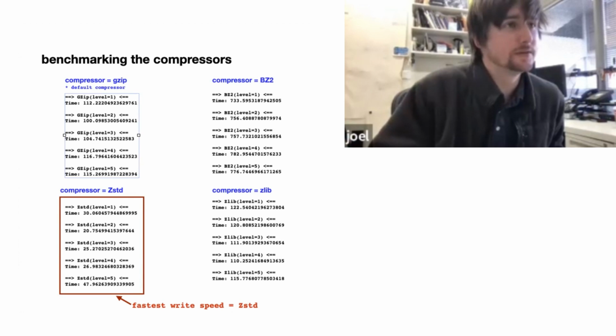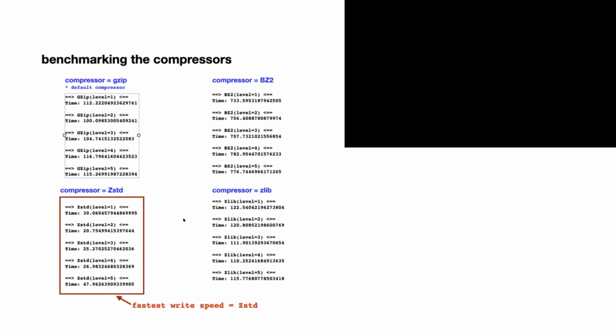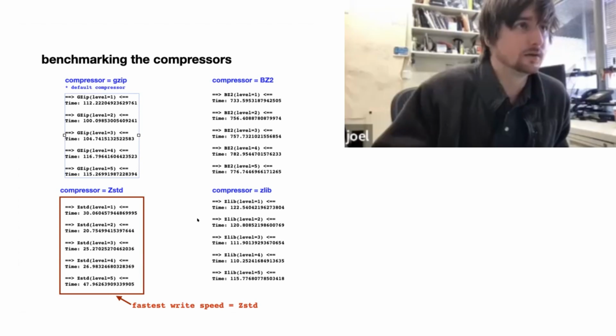Z-stack array. It's got to be. I'm not sure if it's Z-stack because the array can be multi-dimensional, right? Z kind of suggests it's three-dimensional. Yeah, you can work with n dimensions.